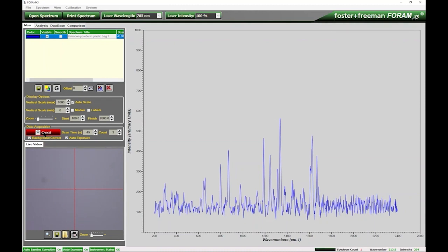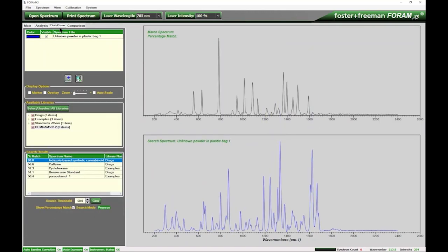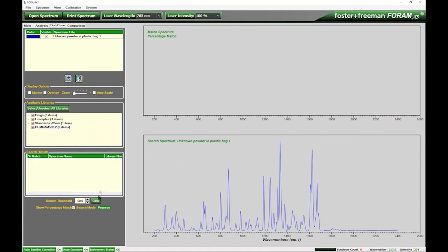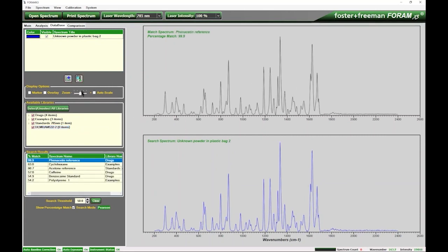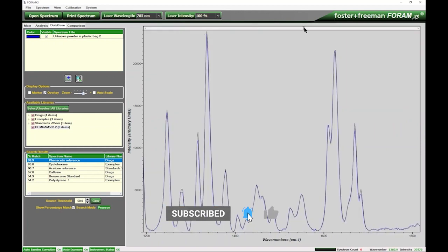And essentially you are then presented with a series of peaks that you would compare to a database. The software will compare the peak positions of your sample to the peak positions of a reference standard and form a percentage match of how closely correlated your sample is to a standard. And then the person undertaking the analysis would visually verify that there's a very good agreement between the sample and the standard, and then form the conclusion that that was the material that was used, or forms the material that you've just analysed.